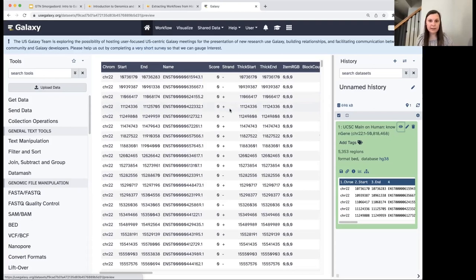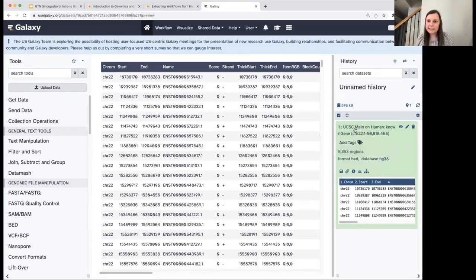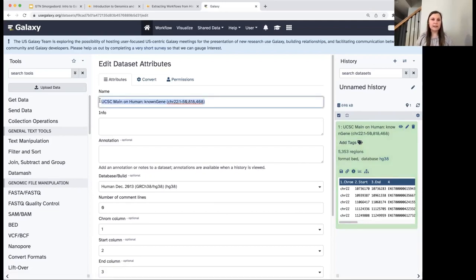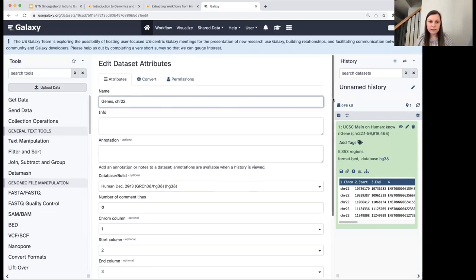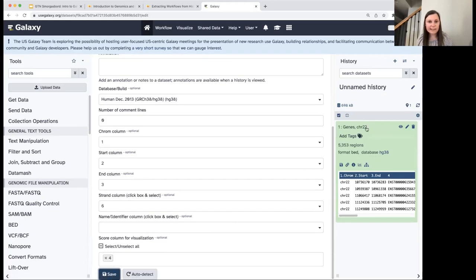Now that we brought in our data, I'm going to rename the dataset to something more informative. I'll click on the pencil icon, which takes me to a form where I can update the name. I'll call this 'genes on chromosome 22'. There's other information you can update here as well. I'll click save.